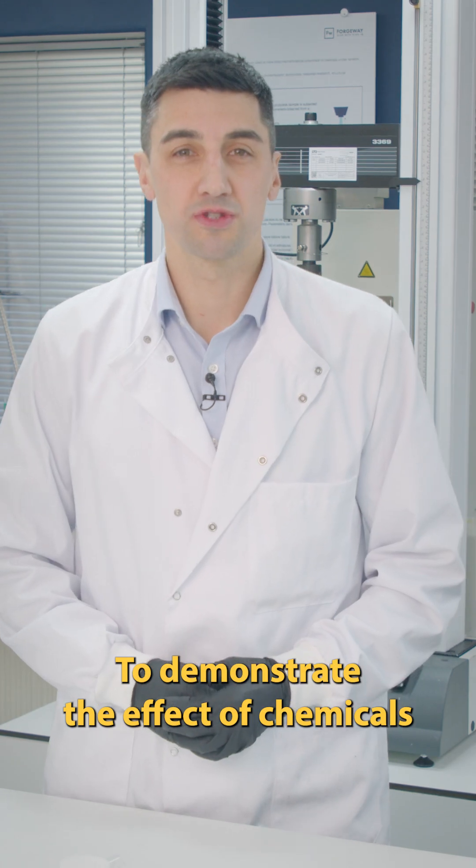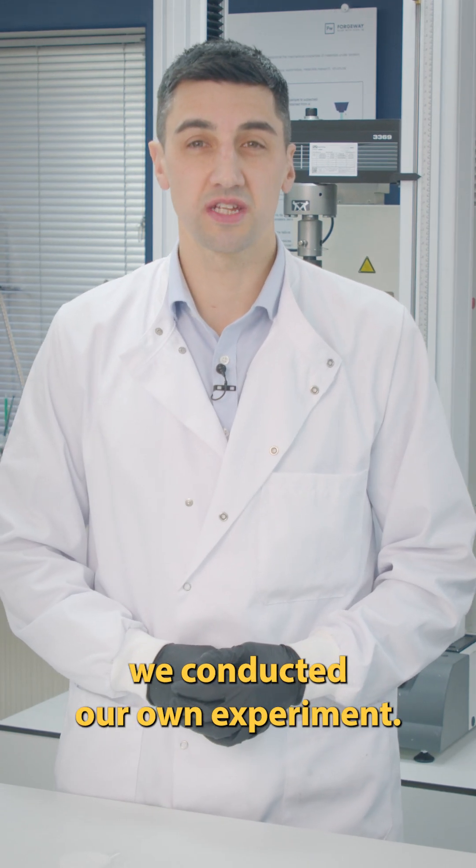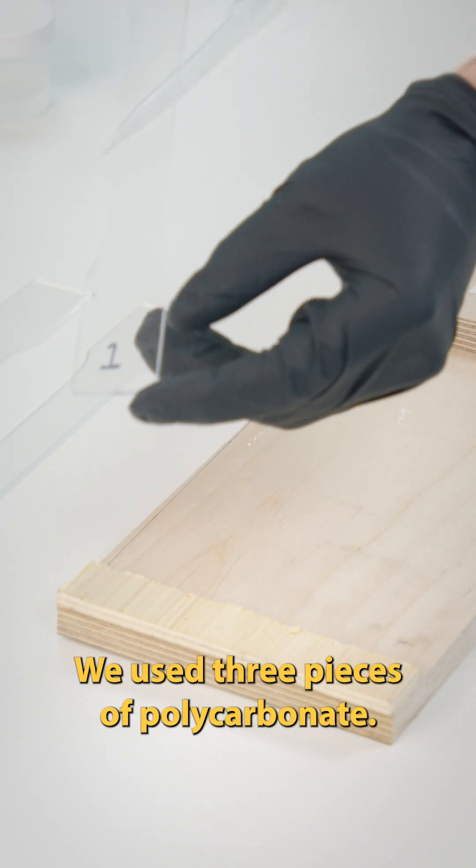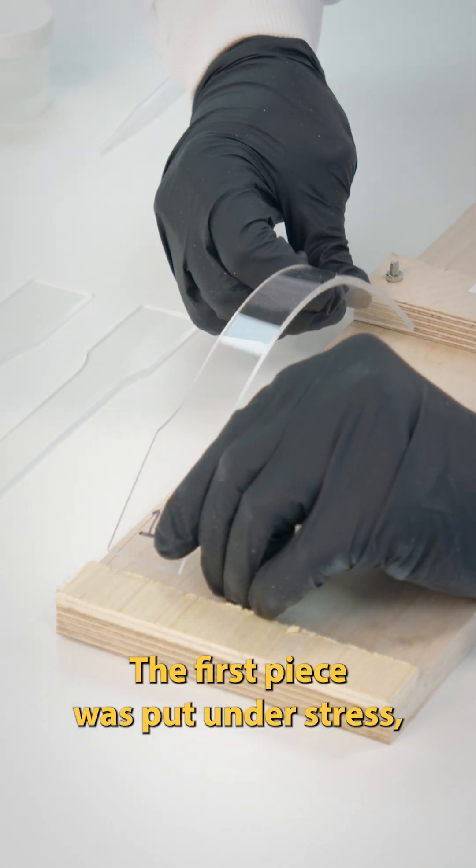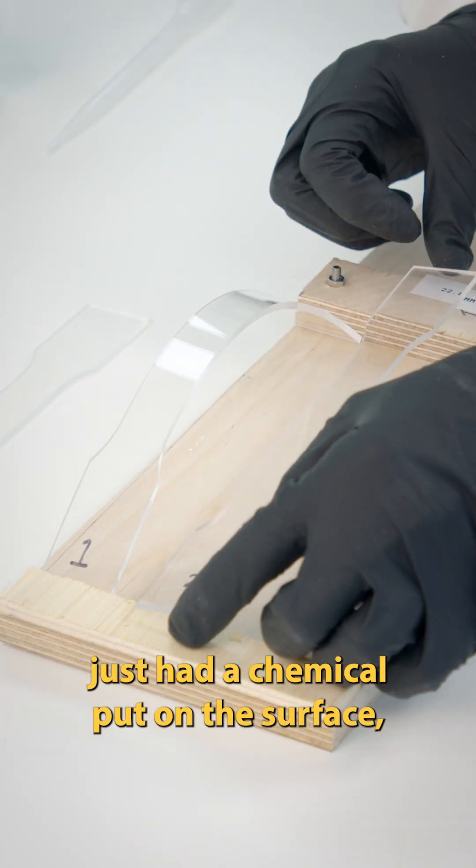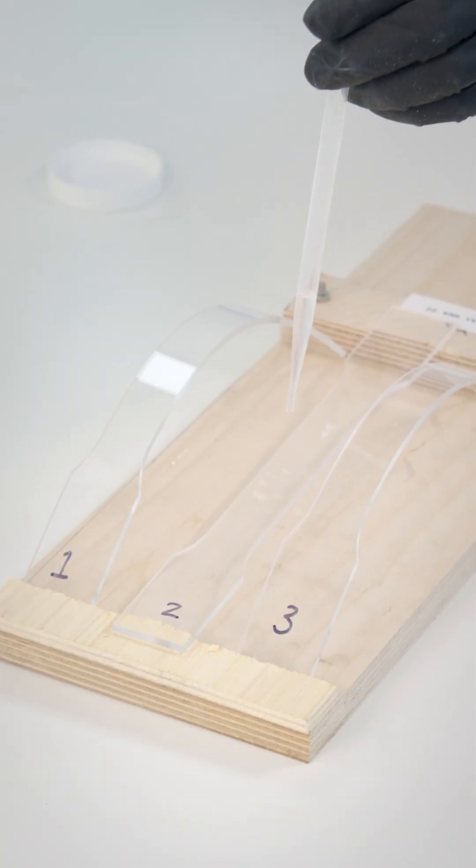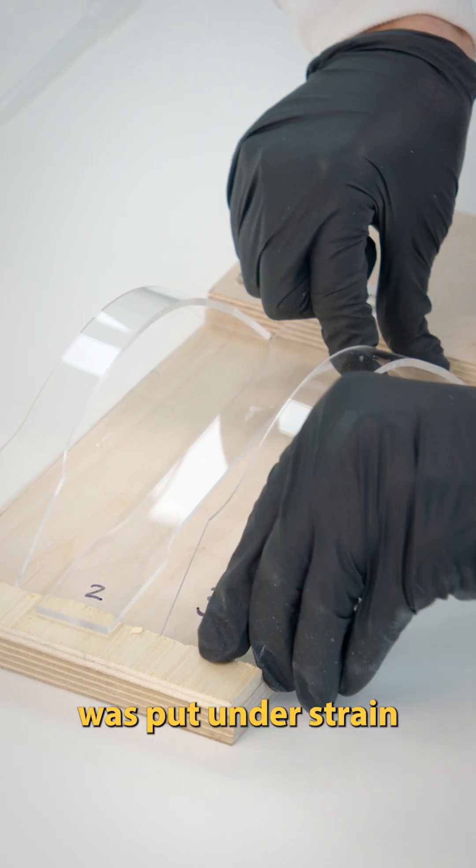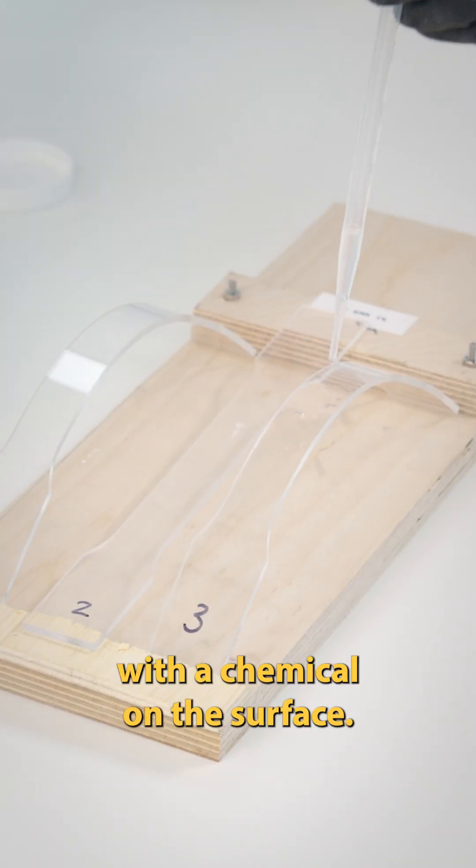To demonstrate the effect of chemicals and plastics under stress, we conducted our own experiment. We used three pieces of polycarbonate. The first piece was put under stress but with no chemicals. The second piece just had a chemical put on the surface, and the third piece was put under strain with a chemical on the surface.